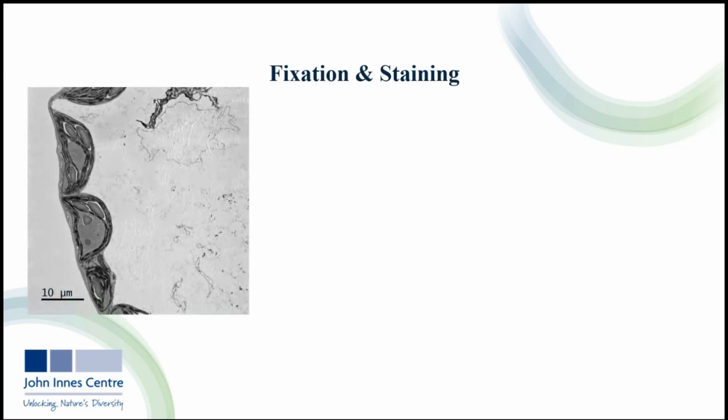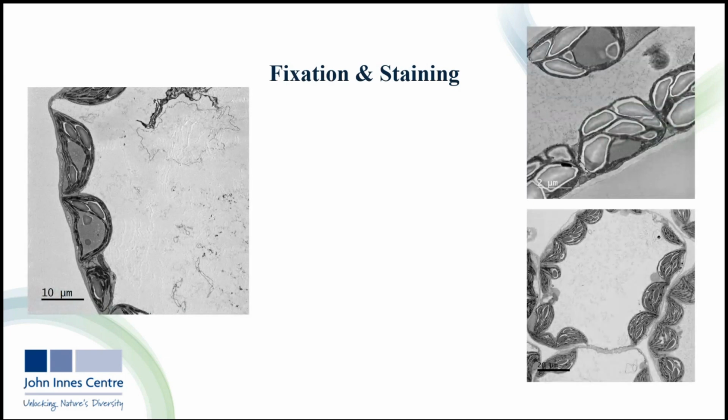And these were the results. As you can see, this is much more improved. The staining has worked beautifully. The initial fixation step using the BioWave showed to be suboptimal, but manually fixing the samples overnight did produce better results. And what's exciting is that we could achieve good staining results without the use of uranyl acetate and lead aspartate, which are typically key heavy metals for staining.